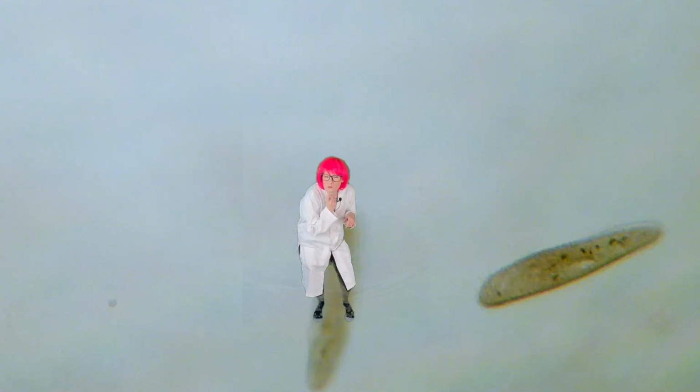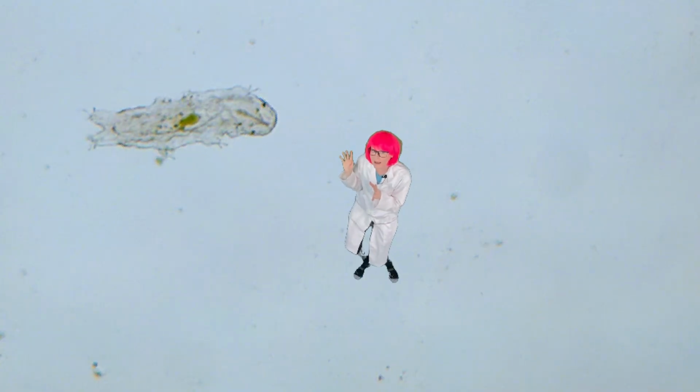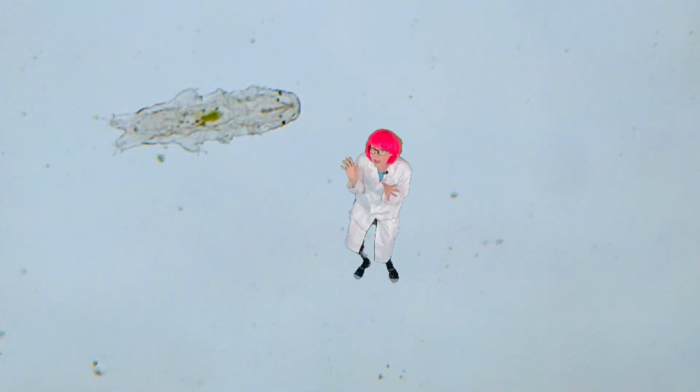Ooh, here comes one. What's this one? And that one? That's a paramecium. Ooh, here comes another one. What's this one?